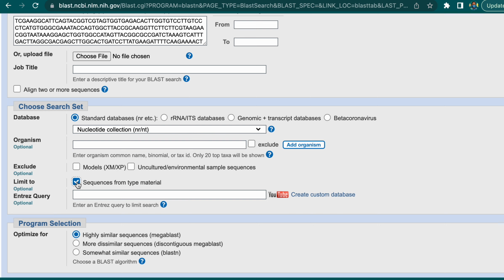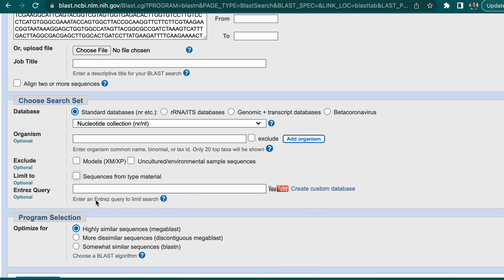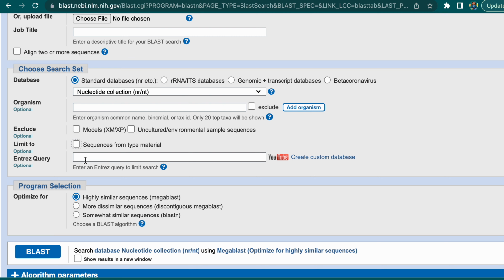So instead of looking for all coronaviruses, we'll only look for the named species of coronavirus, basically, not for all the different variants within those. And if you need to put in a word and say, whatever, Jimmy found this, you type Jimmy in the box and you will only search results that Jimmy himself has recorded. There may be times when you want to do that.